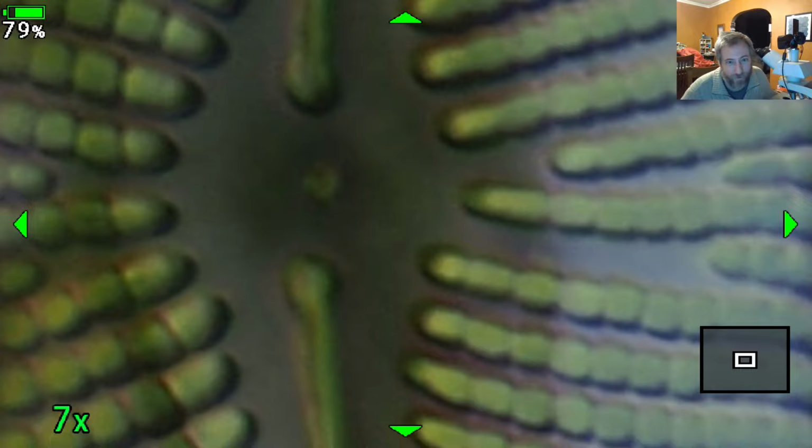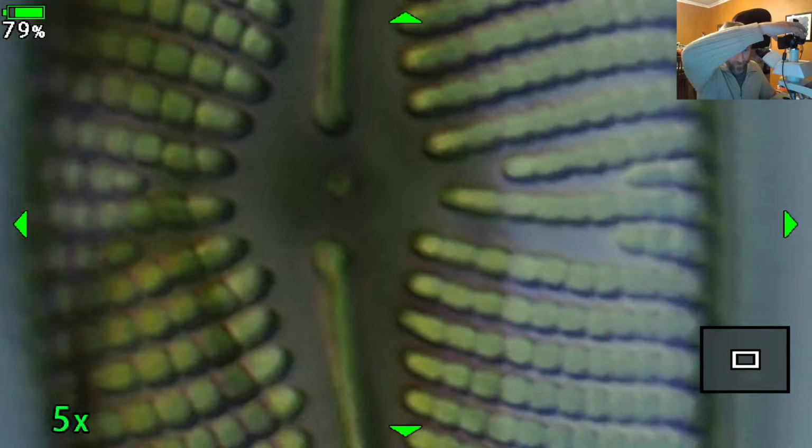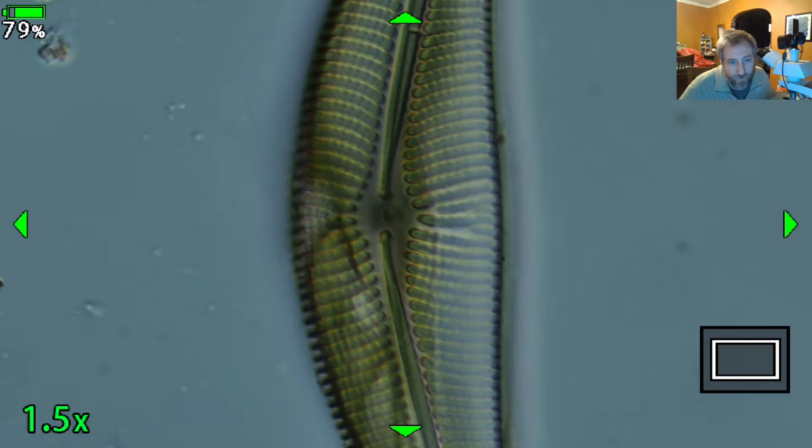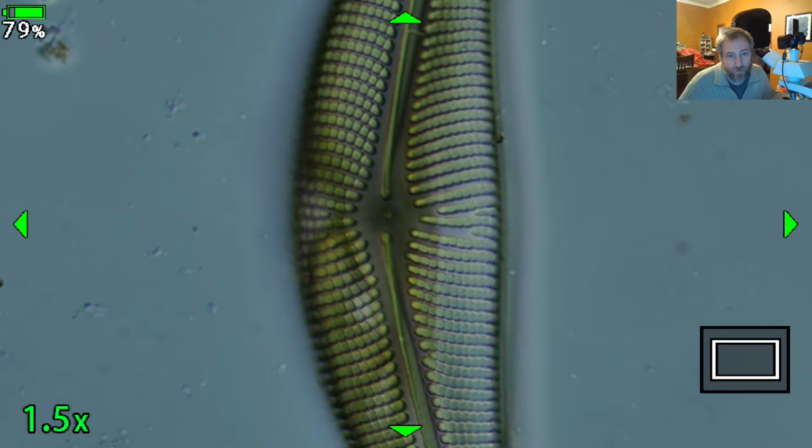So we're zoomed in pretty close. We could get closer. So you can see those structures. That's pretty common for the Mexicana group to have that little dot there in the middle. And the areolae on the striae are those sort of blocky shapes.